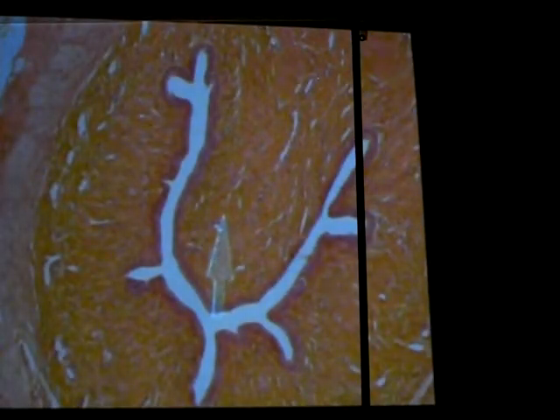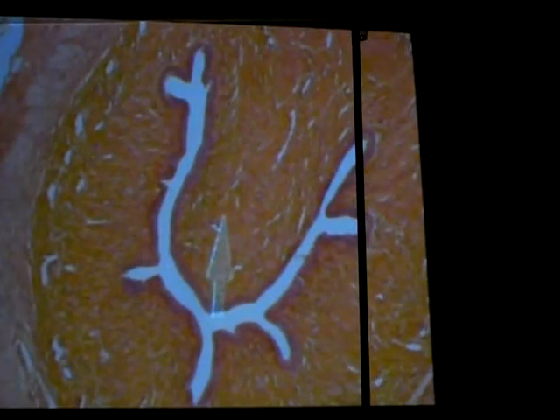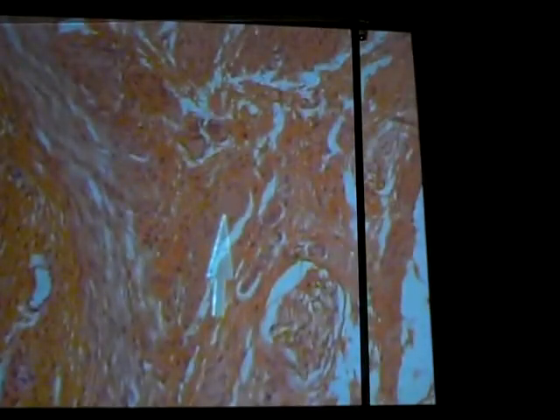the outer portions of the urethra, there's a little bit of skeletal muscle where you have your external urethral sphincter, and that pretty much is what controls your micturition reflex. That's what is going to control your urination. So once you have relaxation of that muscle, then you have urination. So in this one, we're seeing a lot of smooth muscle, but in some slides you see skeletal muscle where we're getting close to the outer parts of the urethra.